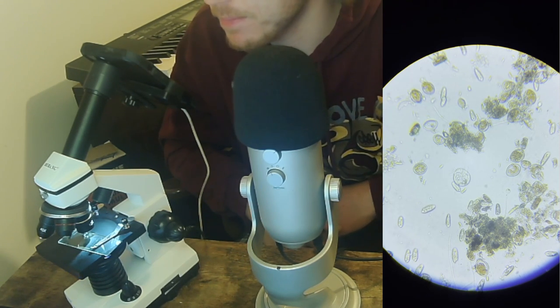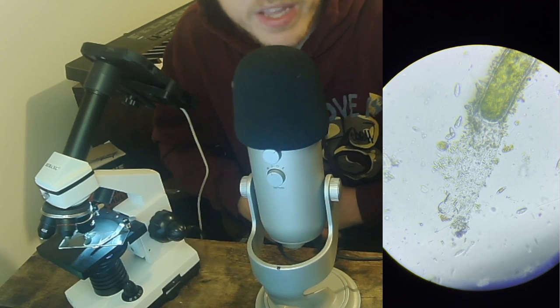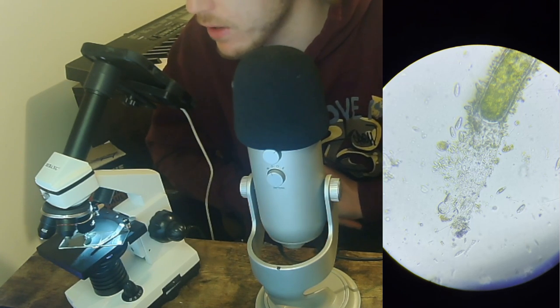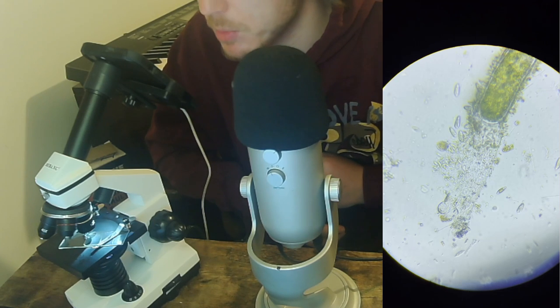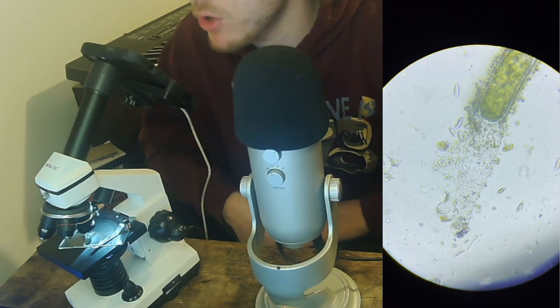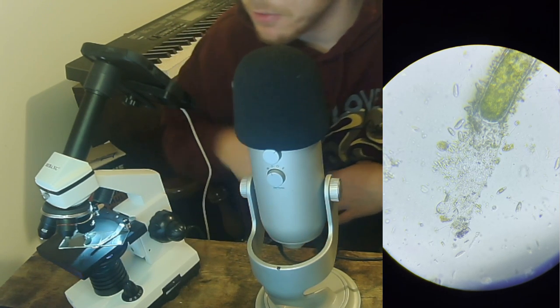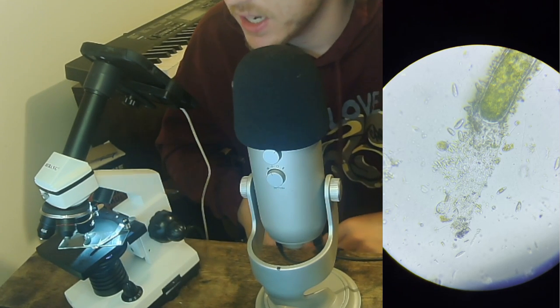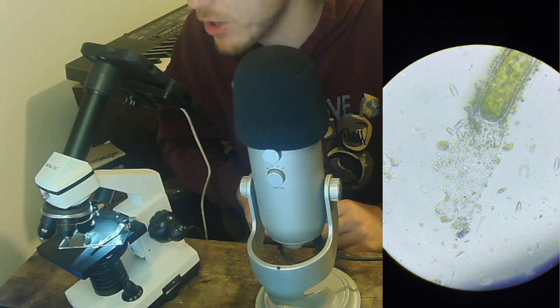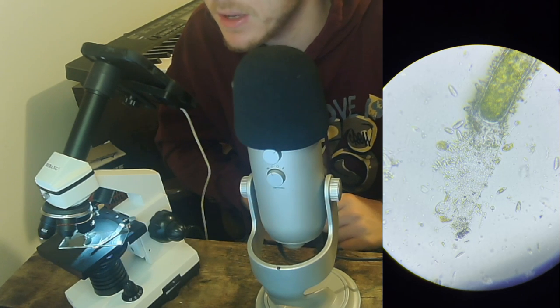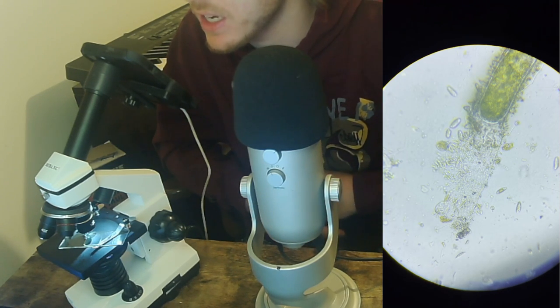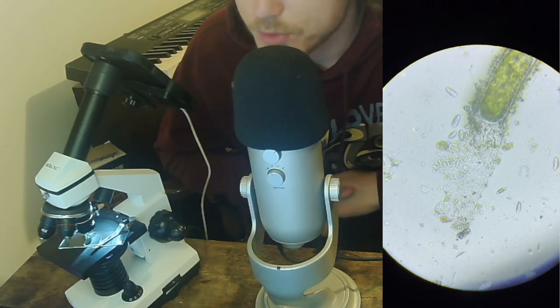All right, well that appears to be most of what I'm going to find today. I've been at it for about an hour and a half now, so I figure there's probably a couple other things I could come across, but hopefully I gave you guys a good idea of all the various things that you could find in a drop of stream water. And if you'd like to give this a try yourself, this microscope was only about 90 bucks on Amazon, and that's pretty much all the equipment that I used came with the microscope. So this is a fairly easy project that you could do yourself if you were really interested in microscopy. I just thought it was really cool to look at what little things are living in the world around us, especially in the areas that I frequent but never really think about the microscopic side of it. So I hope you enjoyed.